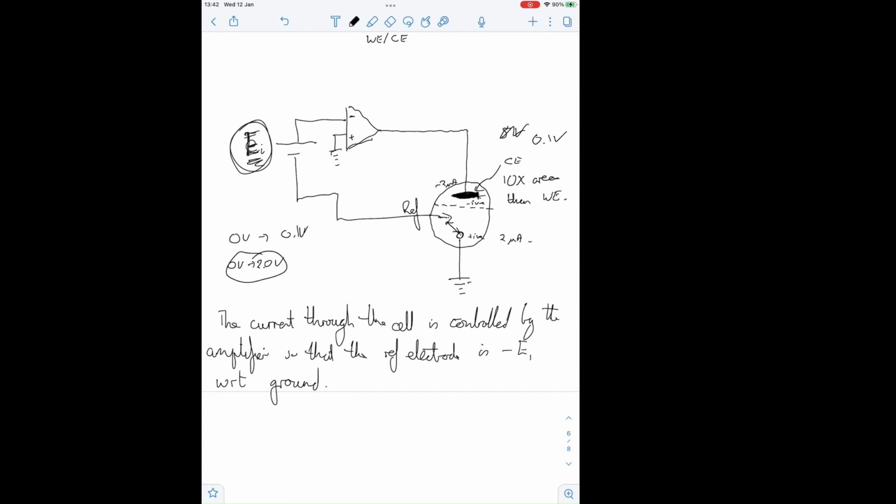So, what's the maximum possible voltage on this electrode? It is something called the compliance voltage of your potentiostat. If you have a small potentiostat, that's typically 5 volts. So a voltage overload means you've driven this potential to 5 volts, but still the current isn't such that you've got the set potential. If you've got a compliance voltage problem, one thing to do is to take a bigger electrode, because I don't need to drive it to 5 volts to get enough current. An alternative is to take a bigger potentiostat.